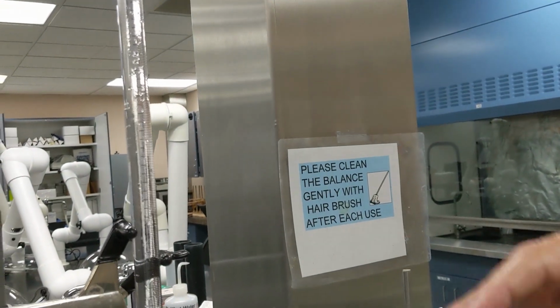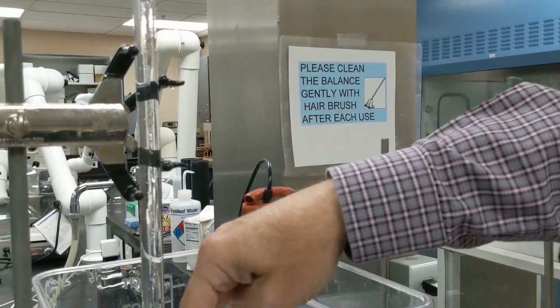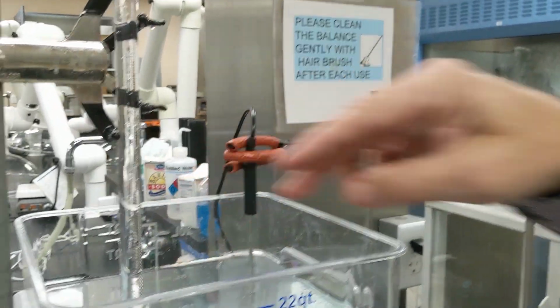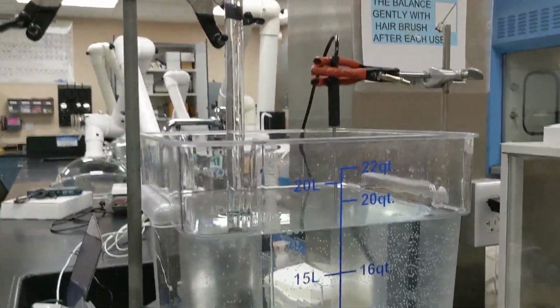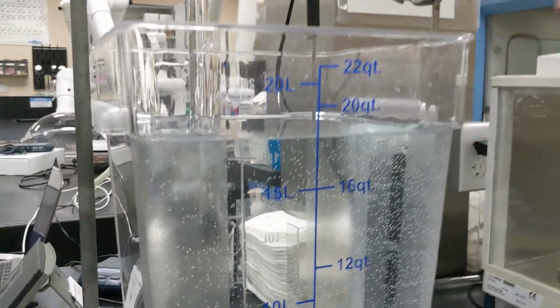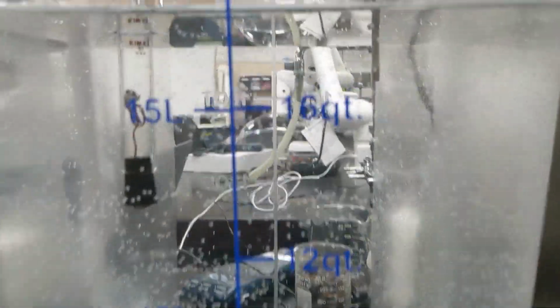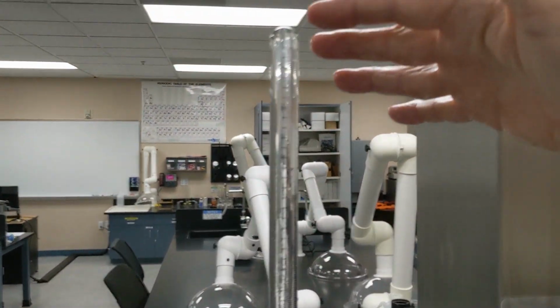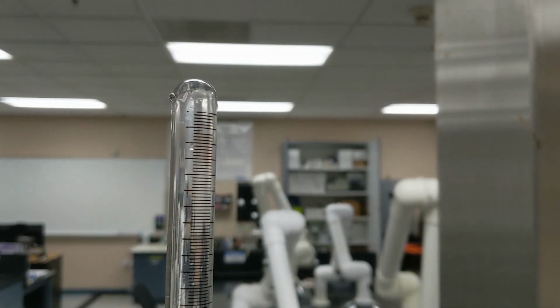Okay, so eventually the hydrochloric acid is going to make its way down to the magnesium, and then it'll start to bubble. Okay, so give it about 30 seconds, another minute or so, we should start to see some bubbles form. And you might not have noticed, but the eudiometer was filled at the start, so our initial volume is going to be 0 mL, okay, which you're going to use in your notebook.